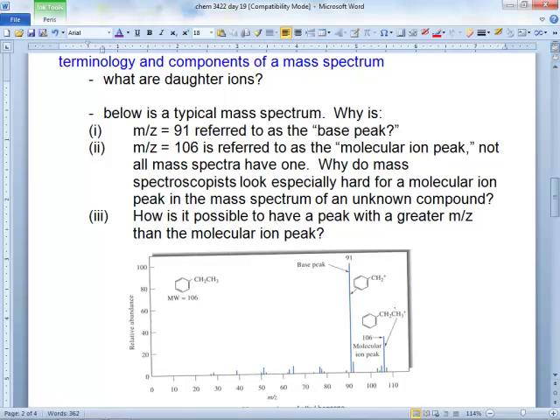Well, it is really the same thing as intensity, but notice how the top is 100. And what's exactly at 100? The what peak? Base peak. So in this plot, instead of intensity, they divided all these little intensities by this guy's height, right? And then times 100. So he's 100% because he's the base peak. So all these are just relatively abundant to that one.